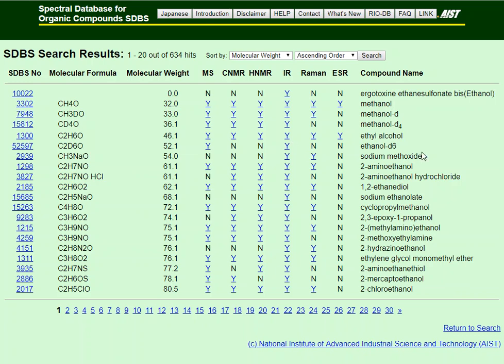All right, so a little bit about ethyl alcohol. Some of the information I can take away. Number one is the chemical structure. Number two is the formula, or what we would call the molecular weight. How much does it weigh in regards to 1 mole of the substance? And then it looks like the Y's all the way across the board. Every Y means yes, that information is in the system.